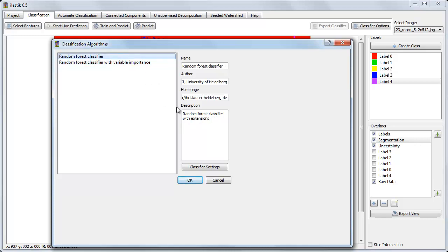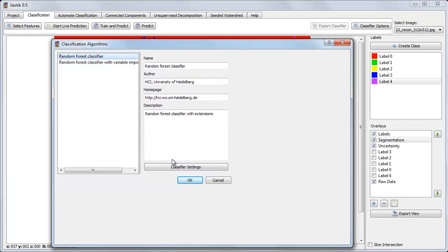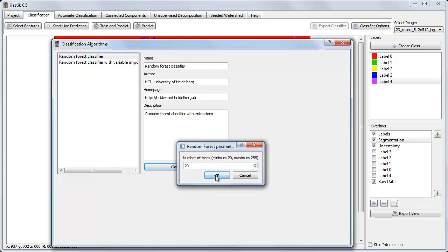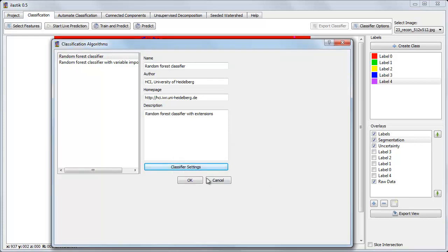But the random forest classifier has one setting. We can increase or decrease this parameter, the number of trees. The fewer trees there are, the faster the predictions, but the more variance there will be in the results.